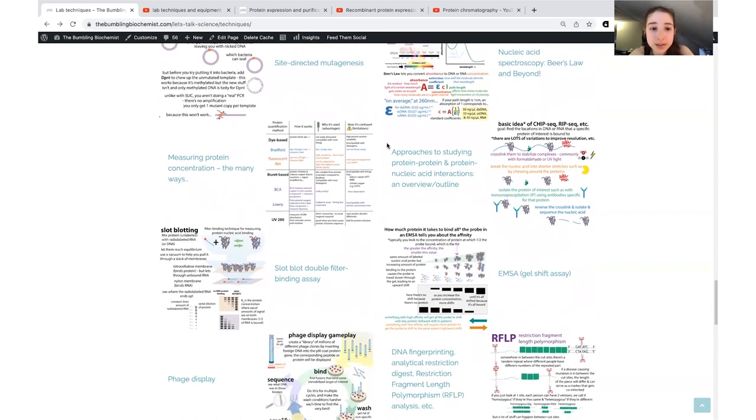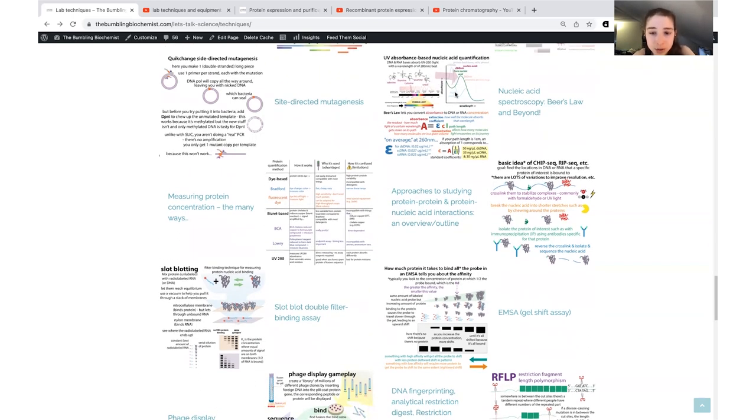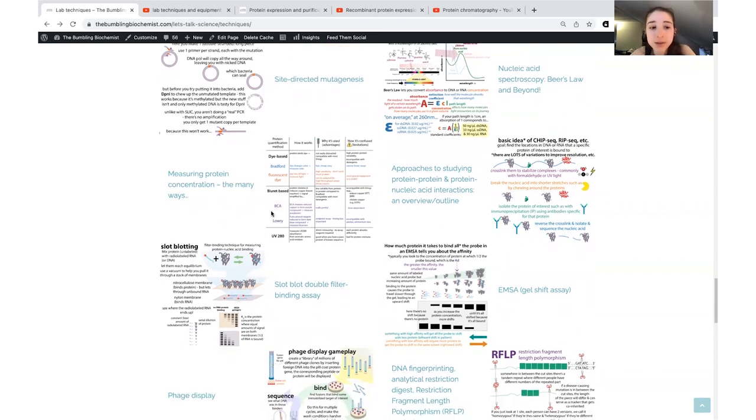Proteins also absorb UV light, and so you can use UV to measure protein concentration as well. With nucleic acids, you're typically measuring at 260, and with protein, you're measuring at 280. That's just where they absorb most strongly and most specifically. There are also other methods for measuring protein concentration, such as BCA, Lowry, fluorescent dyes, and Bradford. Bradford's going to be a colorimetric method. This one is one of the most frequently used, and I have specific posts on those. I have a link to that in the protein expression and purification page, I think.